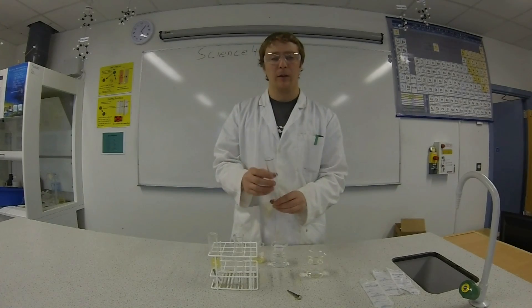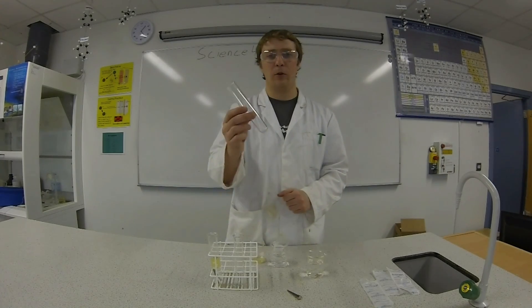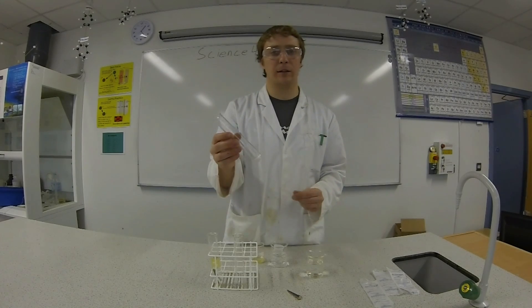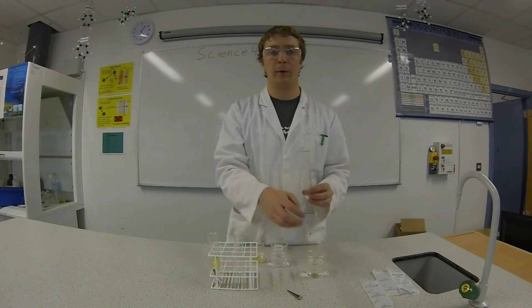The next test tube is going to have oxygen but no water. We have some salt in the bottom of this test tube — that's going to stop any moisture from forming around the nail.